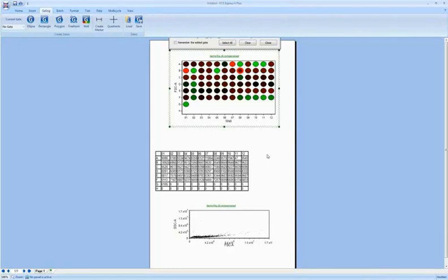Okay, so this is just to give you a brief idea of what the capabilities of the high content analysis are. What I recommend is watching the webinar. Sean goes into great detail and gives a lot of information on using the high content throughput, or the high content analysis module in FCS Express. So that's all the information that I wanted to cover for now.